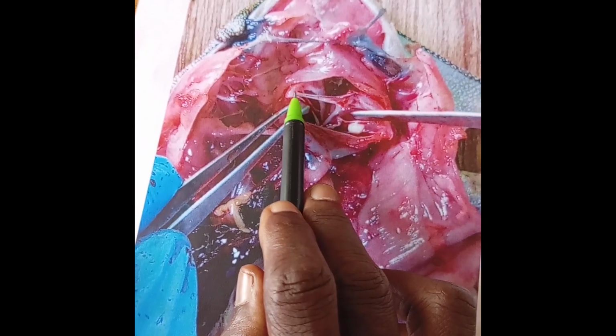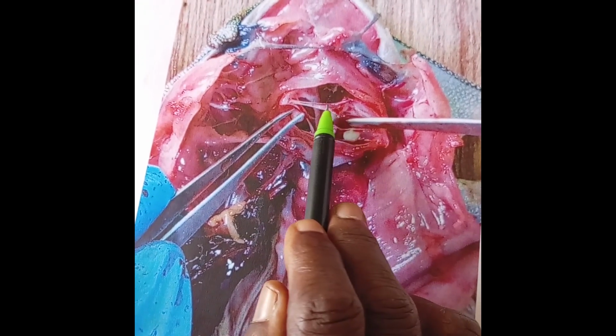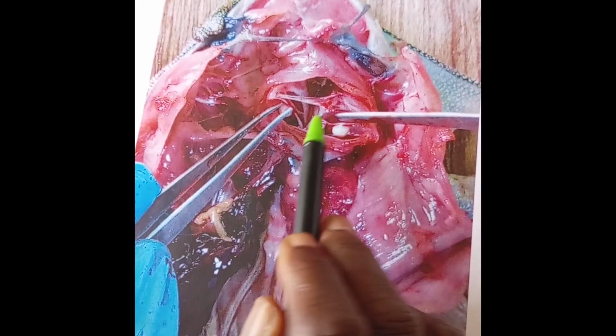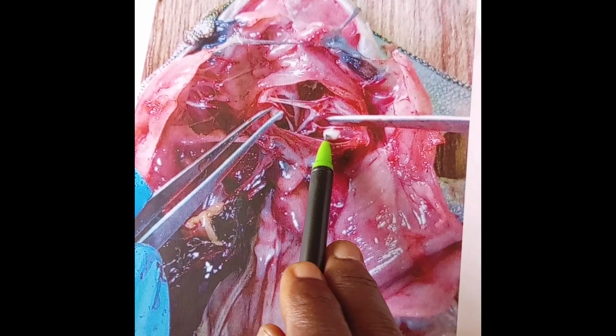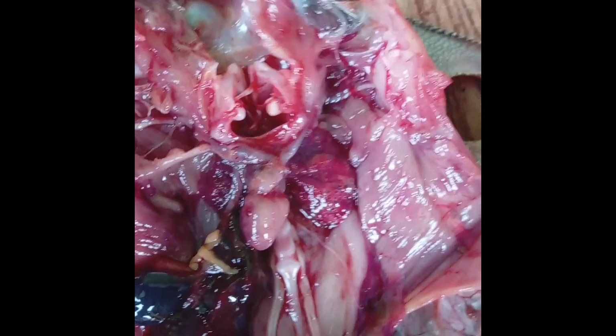And here we have these fleshy structures. They are two. They are vocal cords. They stretch across the chamber. And here we have the vocal sacs. They are two. They are found only in males.